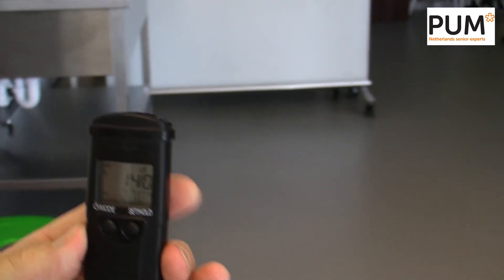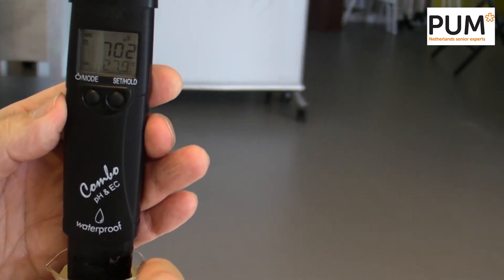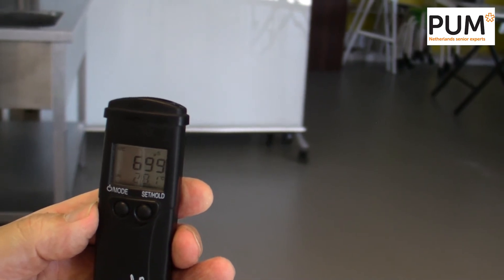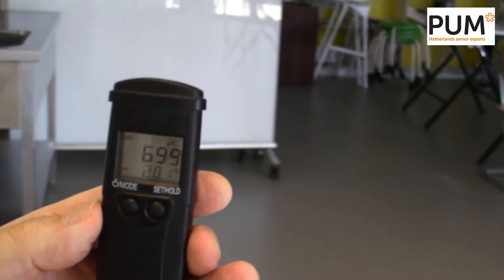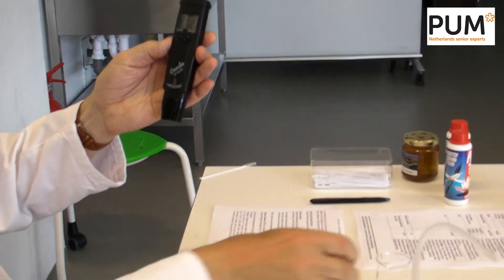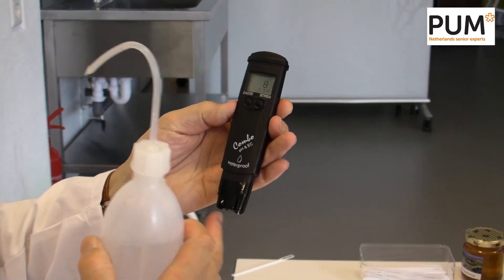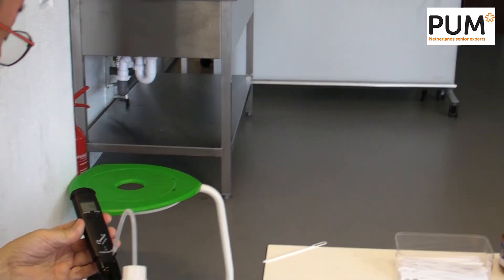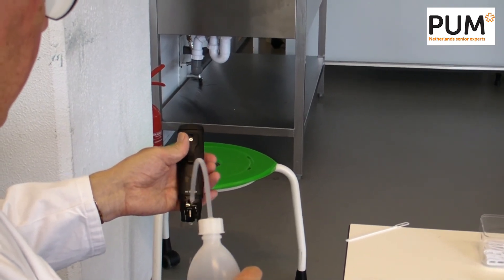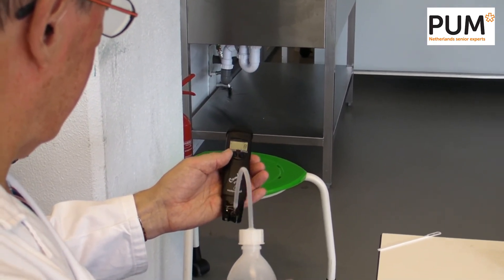Now for the electric conductivity — we are measuring it now. It's an automatic measurement: 7.04, still measuring, and now it's off: 699 microsiemens. Always clean the electrode after use, because there is a lot of sugar from the solution around the electrodes, and you should clean them immediately. Take demineralized water — not tap water — and clean them thoroughly.